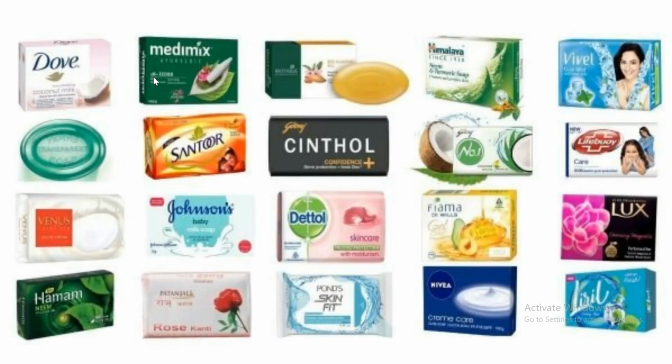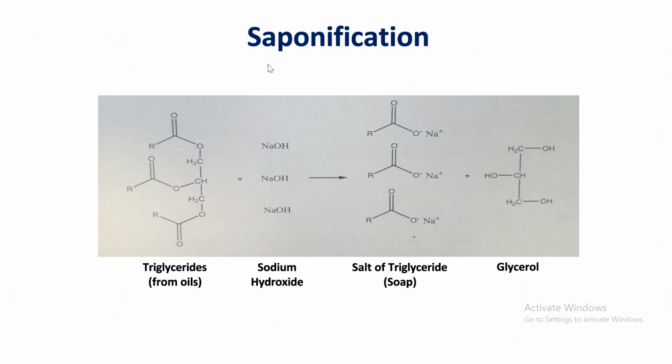As you can see, there are so many different soap options in the market. You have Dove, Dettol, Nivea. There are so many different types, and they're all made from similar processes where you take animal fat and you react it with a very strong base. And here is the process viewed as a diagram.